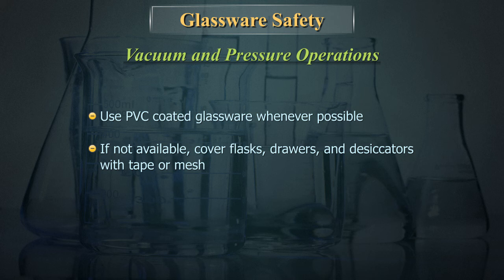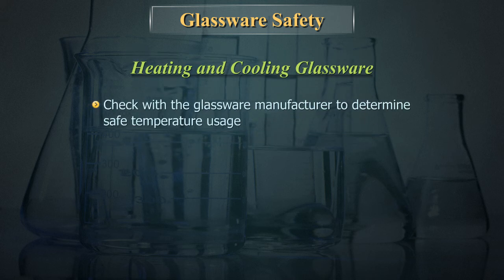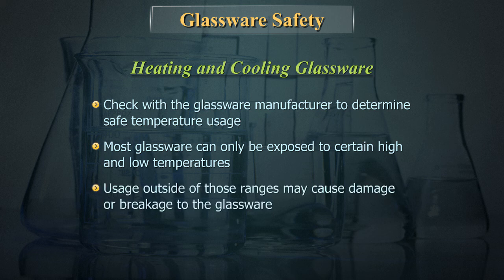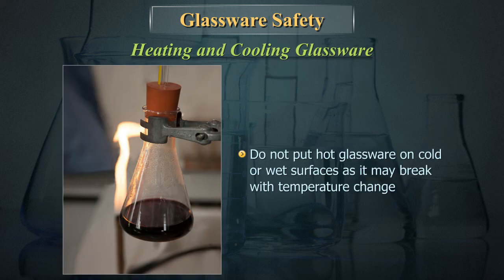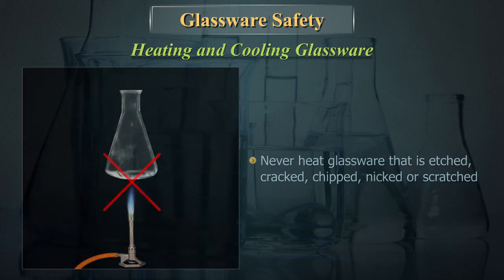Check with the glassware manufacturer to determine safe temperature usage. Most glassware can only be exposed to certain high and low temperatures; usage outside of those ranges may cause damage or breakage. Do not put hot glassware on cold or wet surfaces as it may break with the temperature change. Never heat glassware that is etched, cracked, chipped, nicked, or scratched.